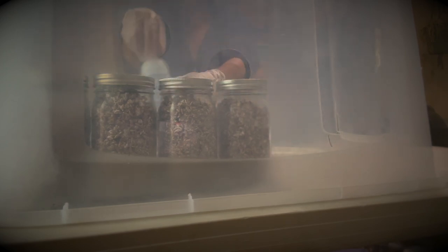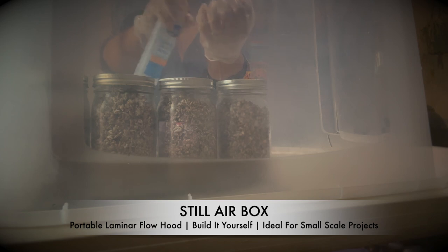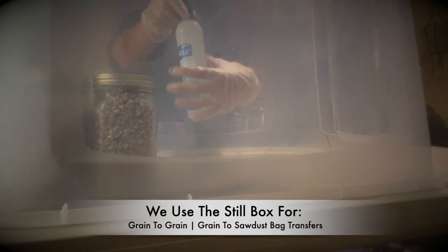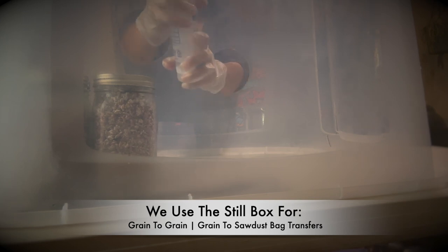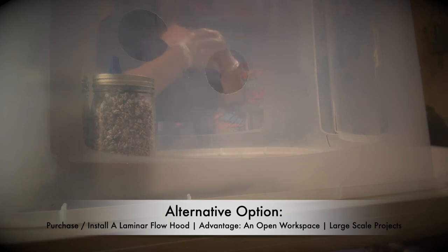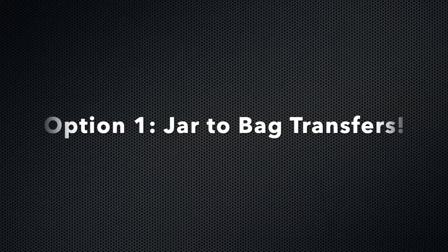What you see here is a DIY version of a still box — it's just a plastic tub with two holes drilled into one side to put your arms through. It's easy to build and a relatively inexpensive way to minimize contamination when doing jar to bag transfers for your mushroom spawn. The purpose of a still box is to create a small space with minimal air movement that you can easily disinfect.